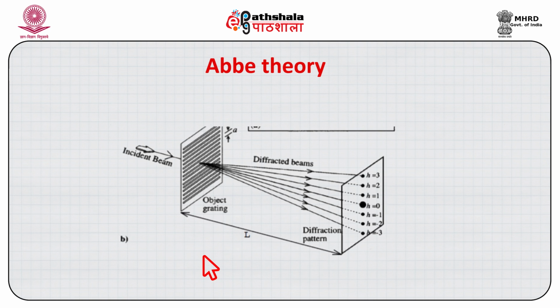The other interesting thing we see by this diffraction is that when an image is produced by this one dimensional diffraction grating, then the object has a relationship which is normal and inverse to the object. So, we have an image which is reciprocal as well as normal to the original object.